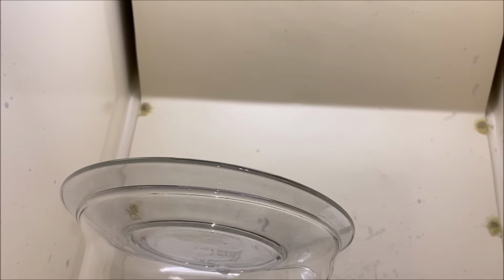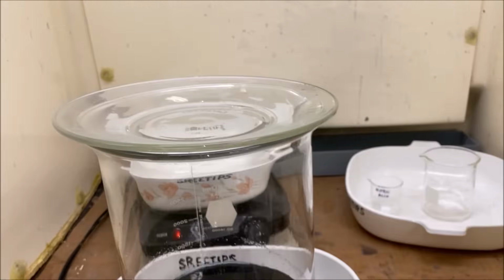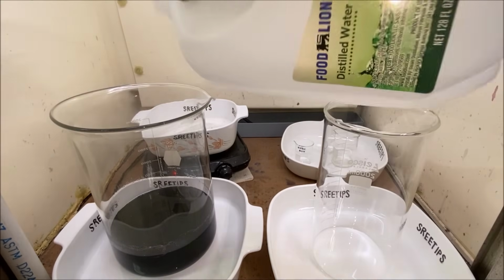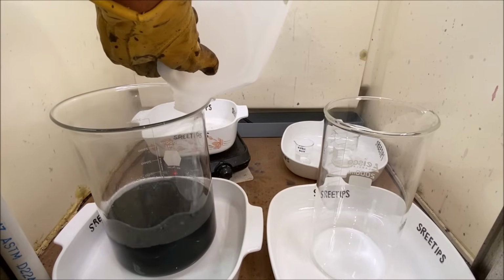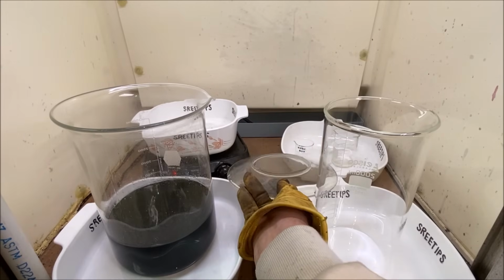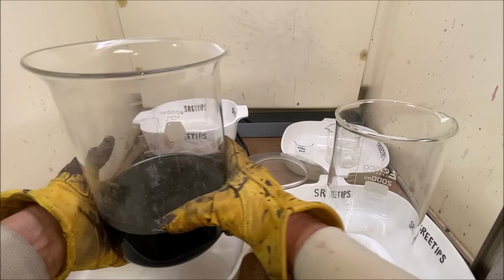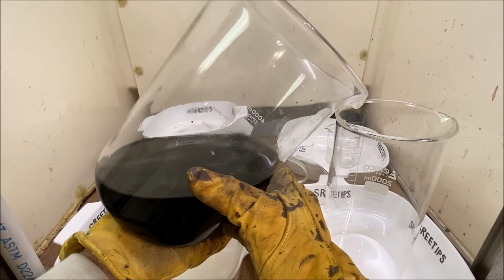So I think what we'll do is we're going to pull this down off the heat now. I'm going to add some distilled water to this. Got to help cool it down a little bit. And now we're going to transfer it to this tall beaker right here and allow it to settle out.